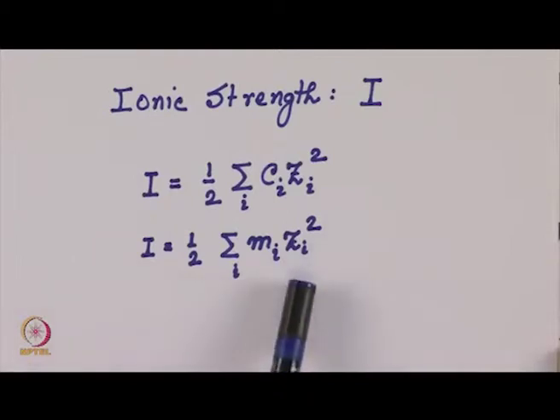Therefore, this is a word of caution: when we report the ionic strength of a solution, we must include contributions due to all possible ions present in the solution.